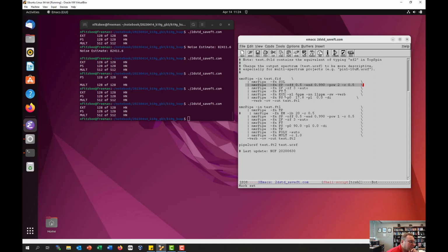Let's see, what else can we maybe talk about here that might be instructive before we move on?